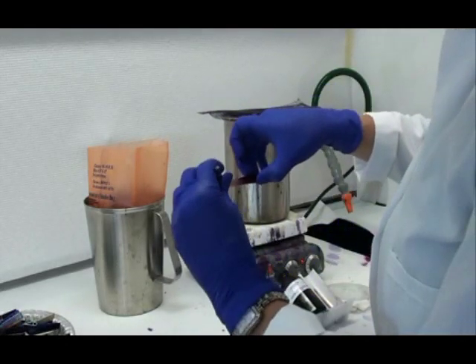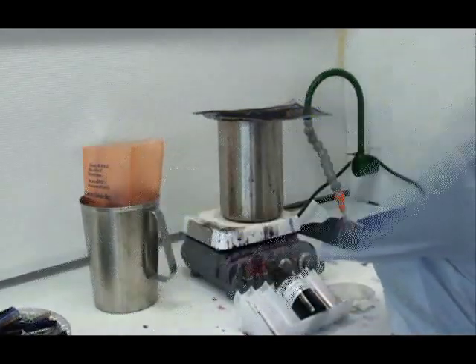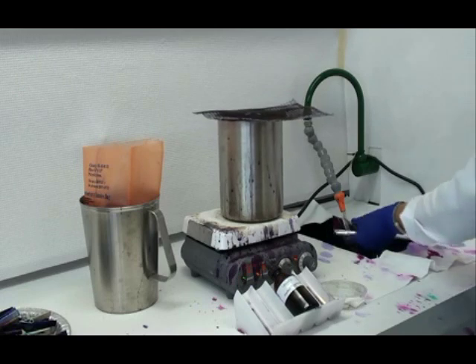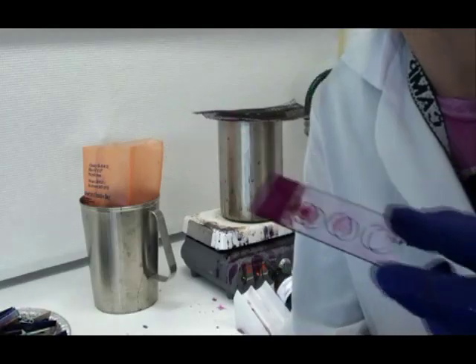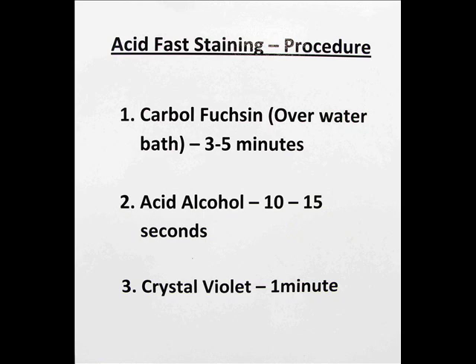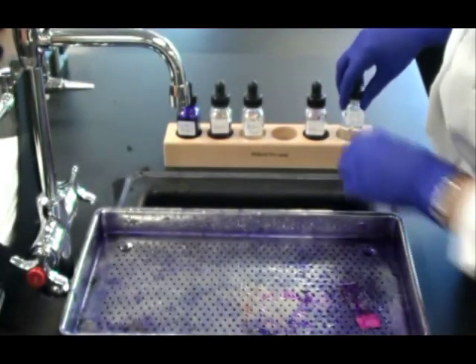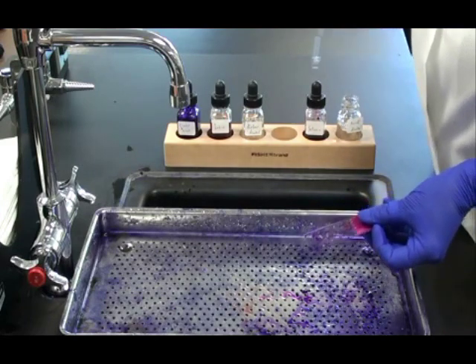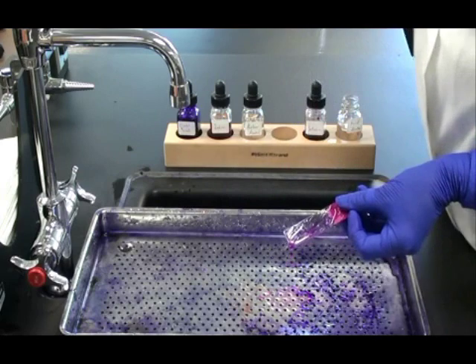Once this first step is complete, I'm going to remove the blotting paper and discard it. Then I will rinse the slide until the water running off it is completely clear. Now I'm ready for my second step, application of the decolorizer, acid alcohol. When I apply the decolorizer, I like to tilt the slide downward and drip the decolorizer over the slide so it runs right down. This way I can see the primary stain being removed from the non-acid fast cells.